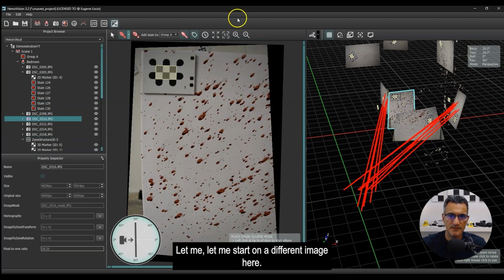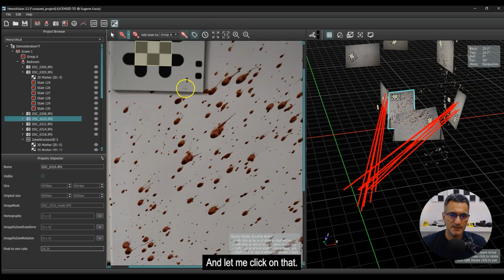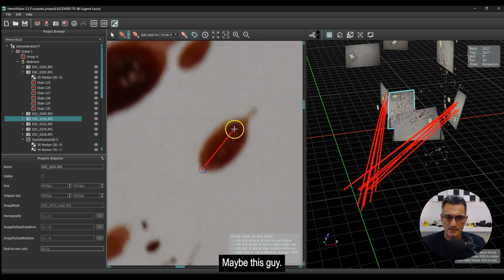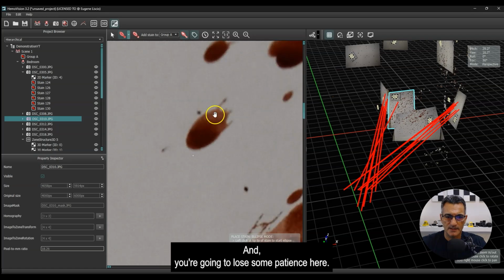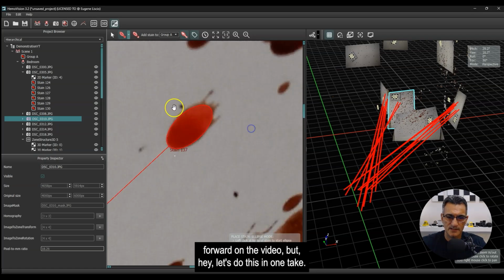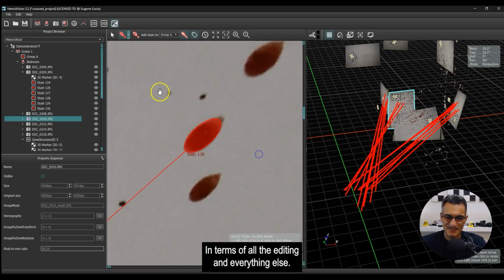Let me start on a different image here. Okay, so I've got a lot here as well. And let me click on that. All right, so let me just start marking some stains. Maybe this guy. And like I said, I'm only going to do like 5 or 6. I don't want to be here all day. And you're going to lose some patience here. Now, I could probably just fast forward on the video, but hey, let's do this in one take and keep it simple for me in terms of all the editing and everything else.